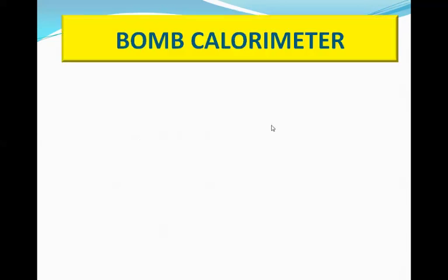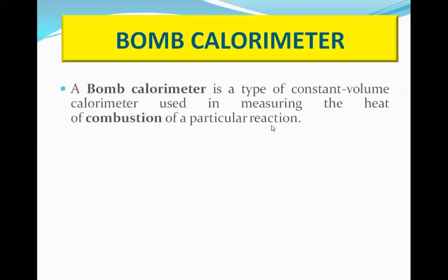Now we will discuss the instrument which is used to calculate the calorific value of a solid and a liquid fuel. As the name indicates, bomb calorimeter. It is a type of, as we have discussed earlier, a constant volume calorimeter which is used in measuring the heat of combustion of a particular reaction.